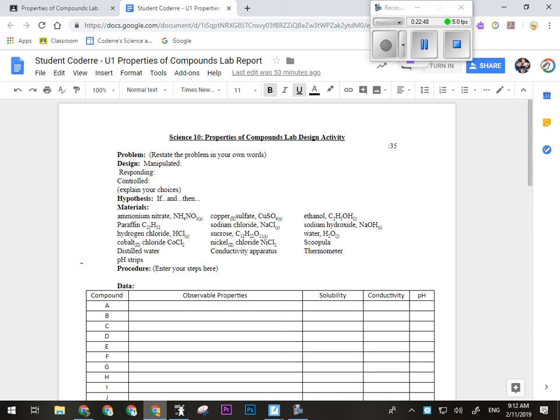If that happens, and it always does, just do that particular one or both of those ones again. But if I've got 12 different samples in this plate, what should I do to each depression? Write it down. Yeah, label it. I'll give you a Sharpie. You can write right on here with a Sharpie. This one's A, this one's B, this one's C, so that you can match them up with the unknowns that are on the table. Otherwise, you'll forget which one was that again. Then you'll be running up front, oh, it looks like it was probably that one. Probably is not a word we like to use in science. Definitely, we like that a lot better.